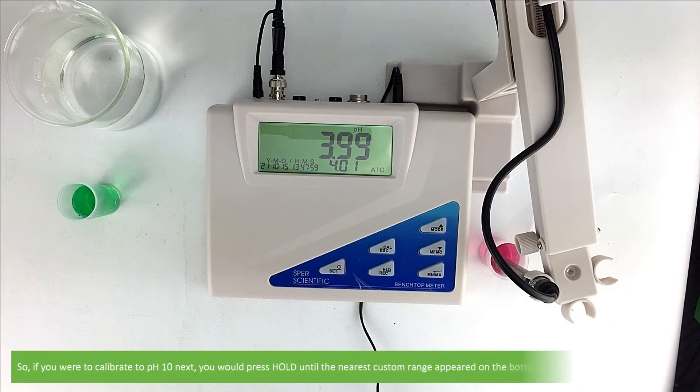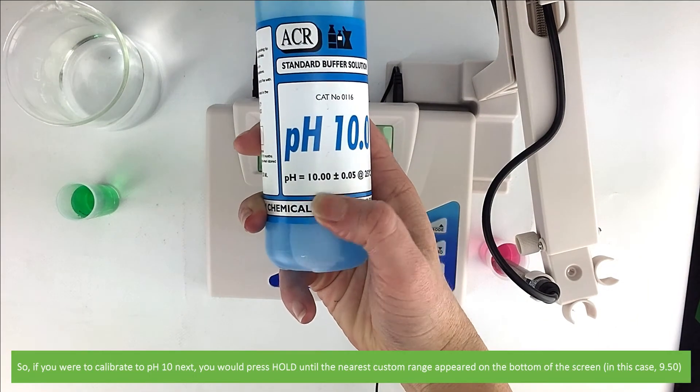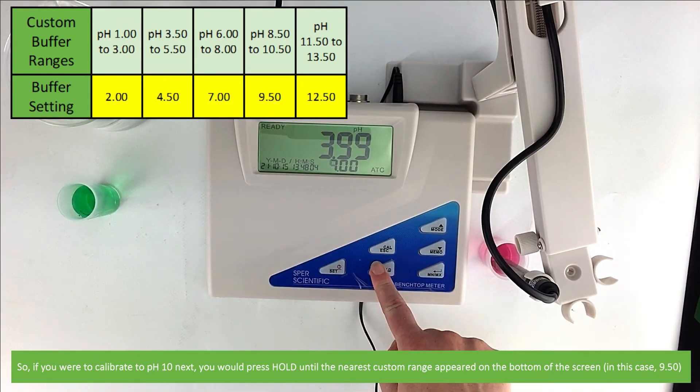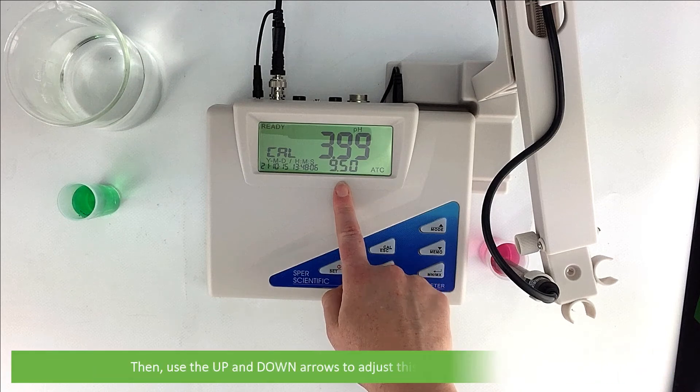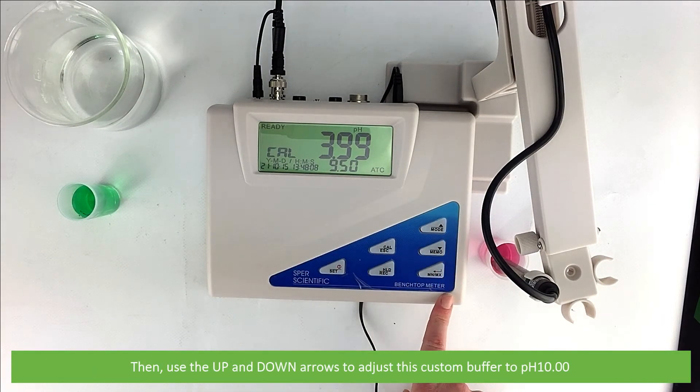So, if you were to calibrate to pH 10 next, you would press hold until the nearest custom range appeared on the bottom of the screen. In this case, it would be 9.5. Then, you would use the up and down arrows to adjust this custom buffer to pH 10.